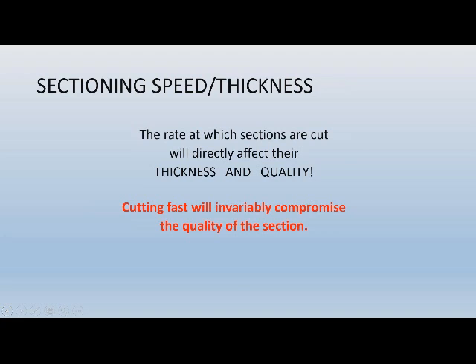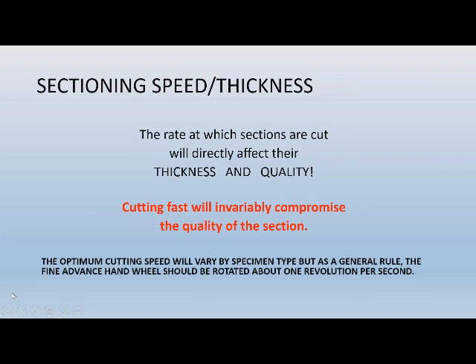If we could measure that, we could show you that you are interjecting pressure as you go down and then lessening it as you come up. This act can actually cause your micrometer to jump a half a micron, a full micron, who knows how much, depending on just how much pressure you're putting on it. So you are very apt to get thick and thin sections.